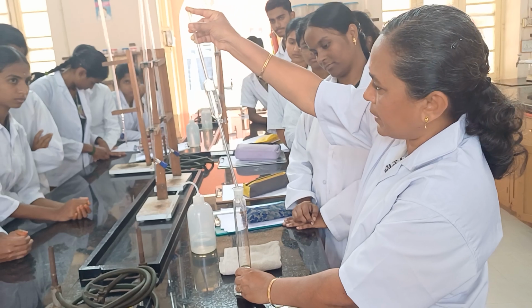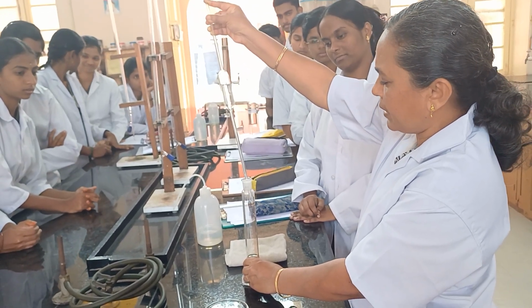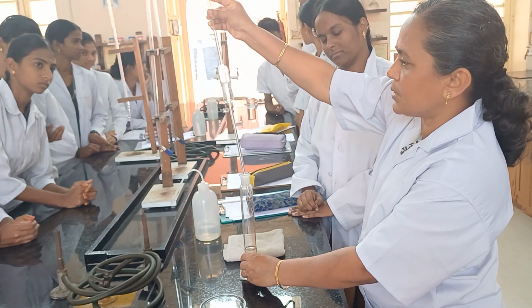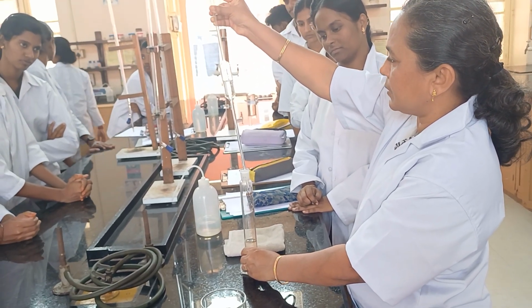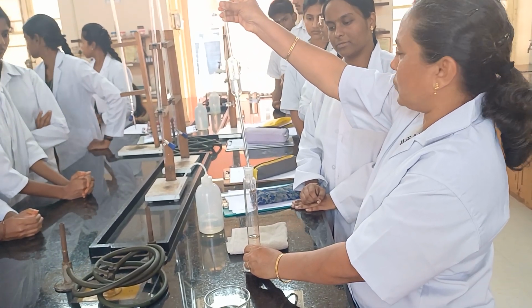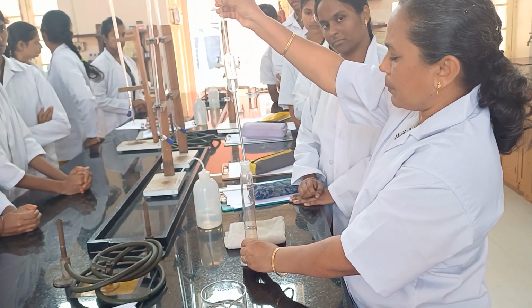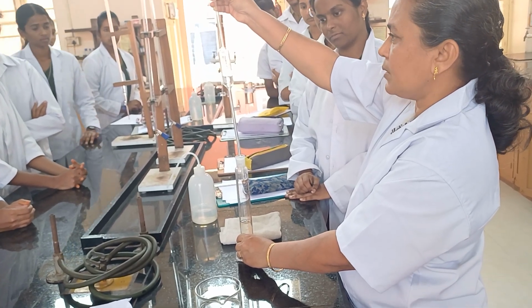So W is the weight of the soil, 20 gram. V1 is the volume of soil, 17 ml. V2 is the volume of water added, 50 ml. What is V3? We simply add V1 plus V2, so 17 plus 50, 67 ml. That is V3. Then after completely transferring the water, we have to keep it undisturbed for 30 minutes.